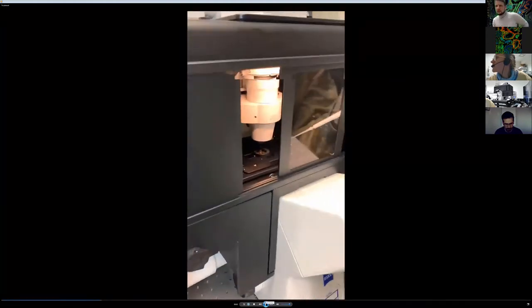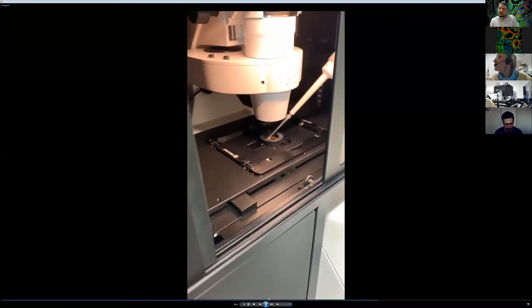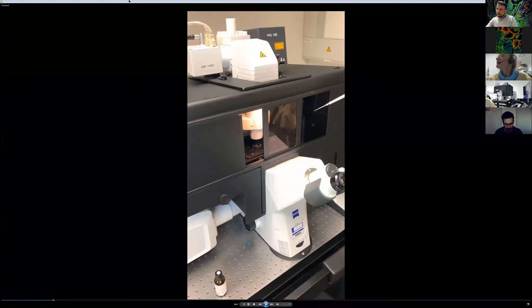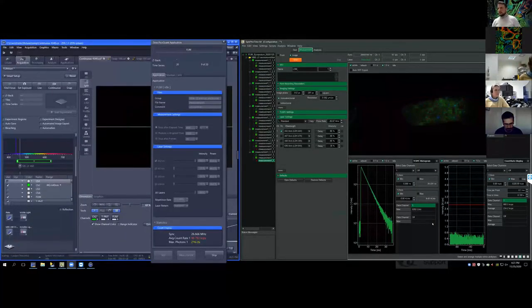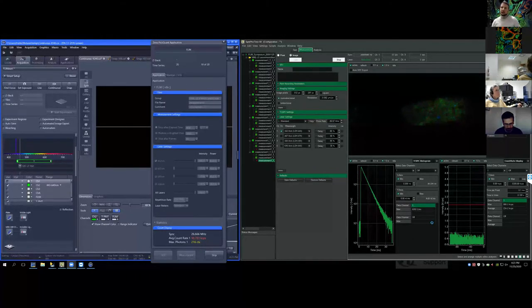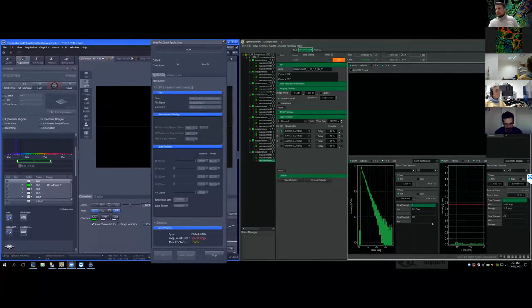The spatial resolution of FLIM is not the same as ARISCAN — FLIM-FRET spatial resolution is actually much higher than ARISCAN in terms of interaction versus colocalization. There's some drift visible, so I readjust focus. We're now seeing two effects simultaneously: bleaching from high laser power, and the ammonium chloride effect causing a drop in dye intensity as lysosomal pH increases. After ammonium chloride addition, some lysosomes may disappear, which is also normal. The combination of both effects makes it hard to see clearly.